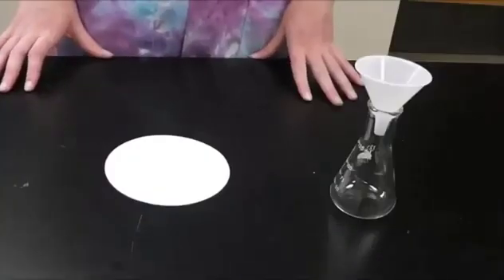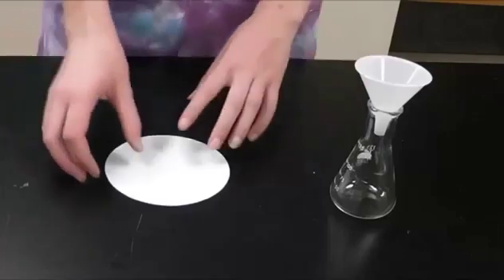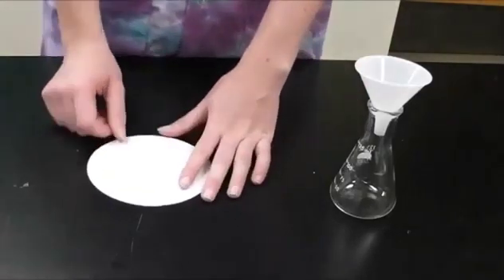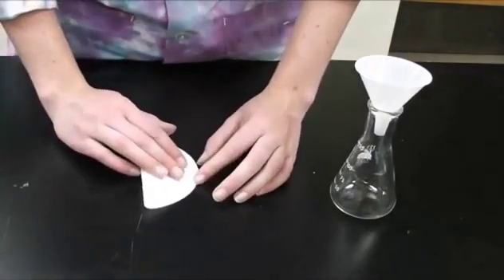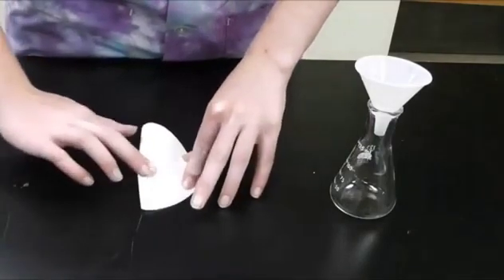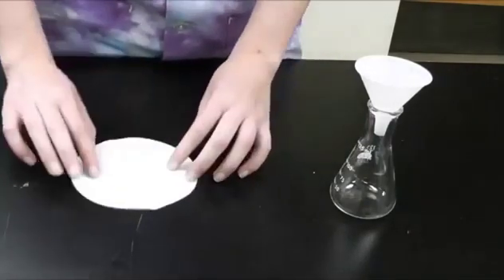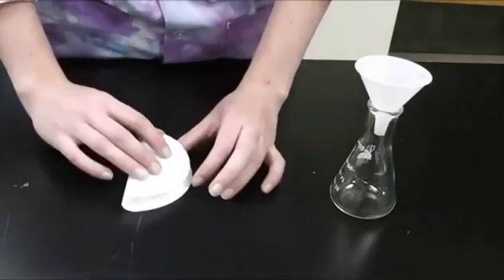This is the kind of filter paper we use for gravity filtration, which is when we extract impurities or other solids from a liquid. To start, fold your filter paper in half. Then open it, rotate it 90 degrees, and fold it in half again.